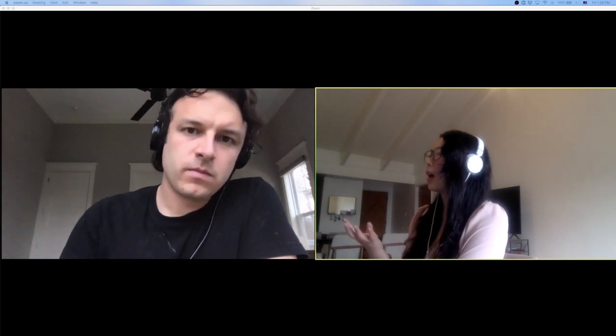I was saying that it's quite surprising, or not surprising, but we've actually covered a lot of the questions I had. So for the rest of this, I wanted to go through the few questions that I have left, and then have Colin do whatever he needs to do to explain the rest of the UI for onboarding purposes. So yeah, if you want to take it away.